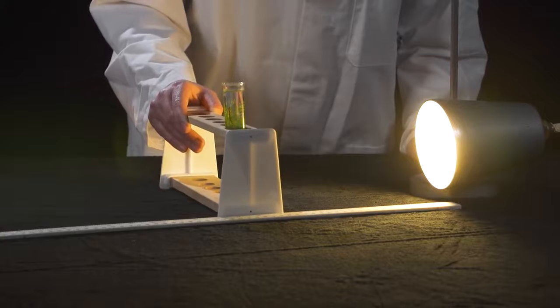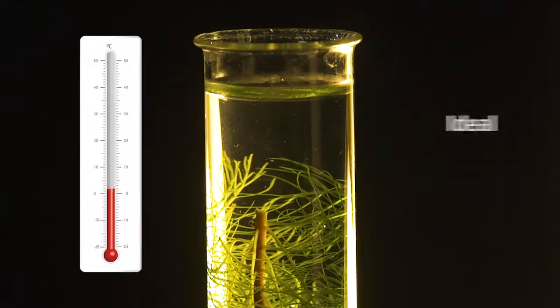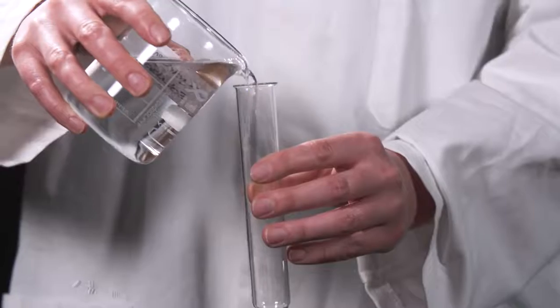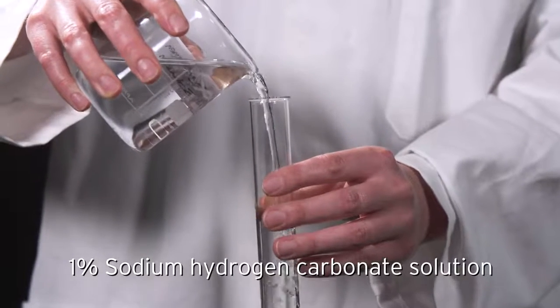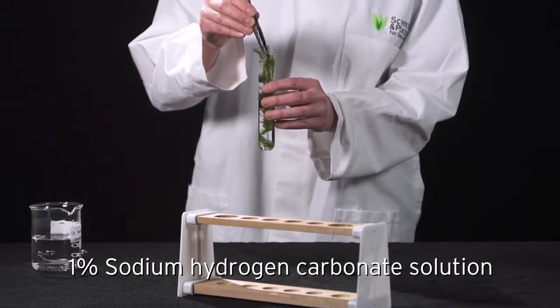It's also worth considering temperature for the practical itself. Although it may be difficult to control the temperature in your individual lab, a warmer environment will mean warmer water, which means that photosynthesis will occur at a faster rate. If it's possible for the room to be warmer, above 20 or even 22 degrees Celsius, this will help your pondweed produce a good stream of bubbles. Another rate-limiting factor for photosynthesis, the availability of dissolved carbon dioxide in the water, can be eliminated by placing pondweed in a 1% sodium hydrogen carbonate solution that has also been allowed to come up to room temperature, instead of just water.